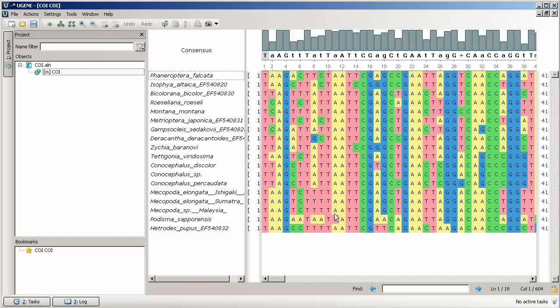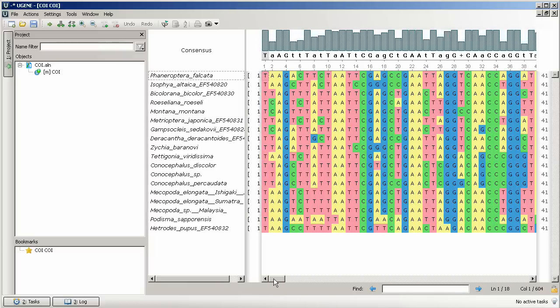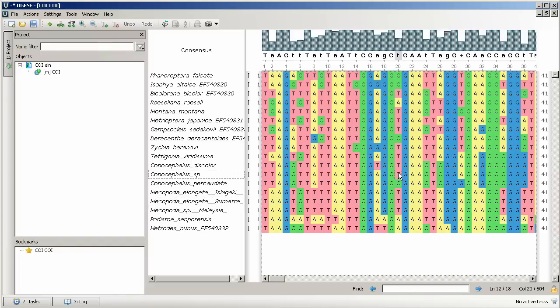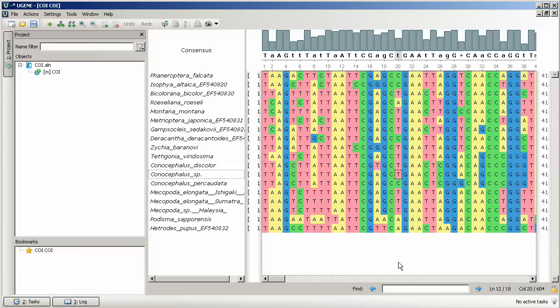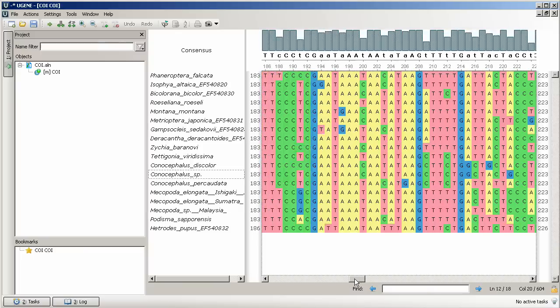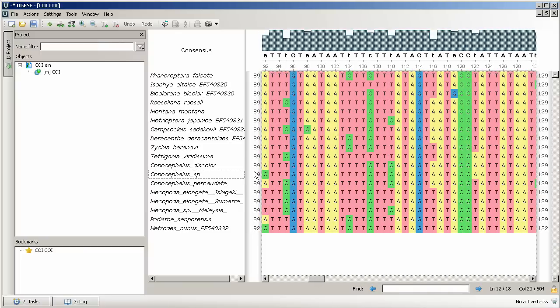Also at the bottom of the view we have names and sequences scrolls and nucleotide search bar, the global cursor coordinates, and the alignment lock status icon. Our alignment object is not locked.